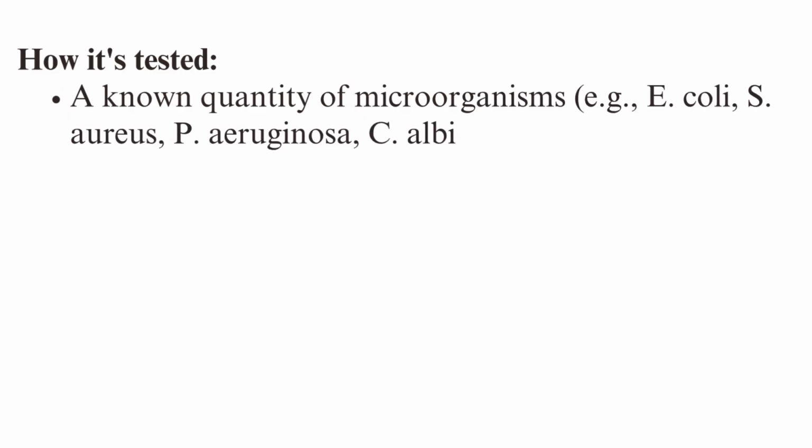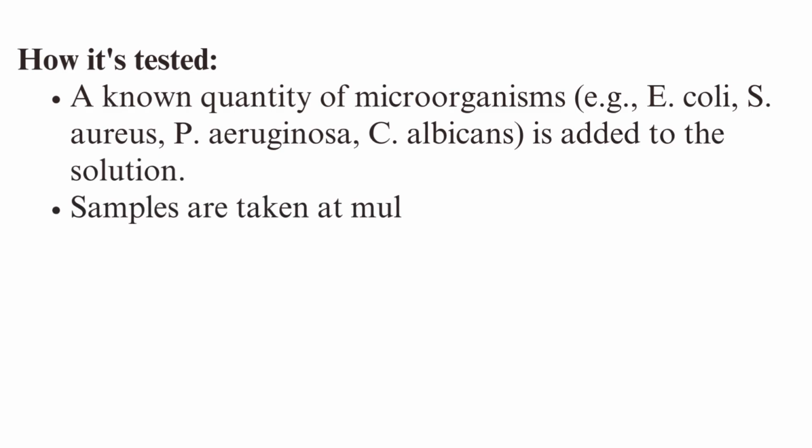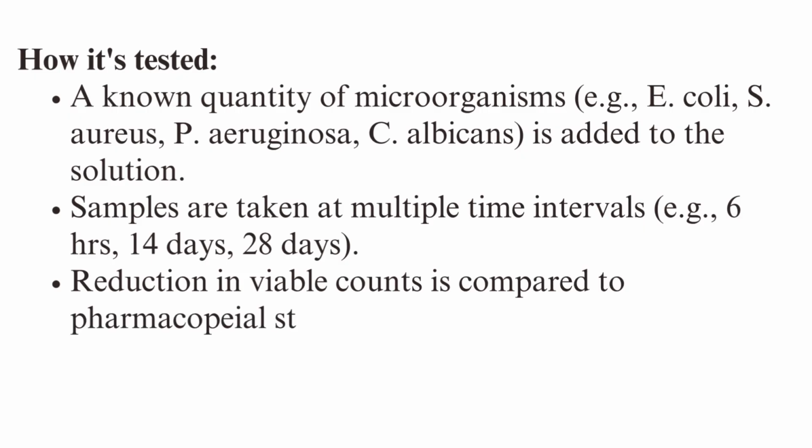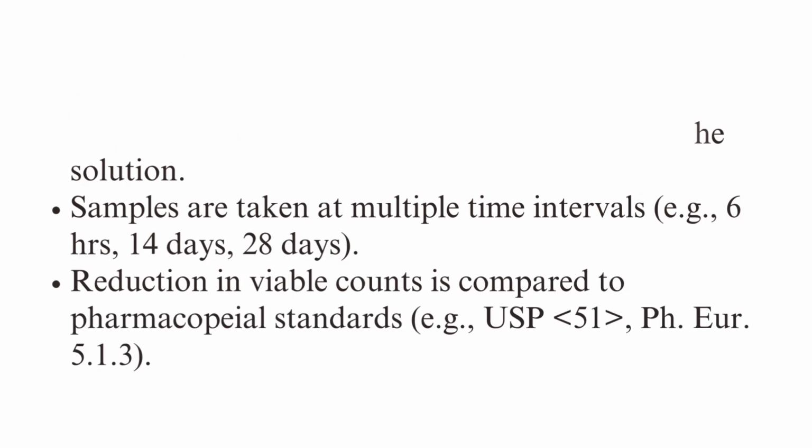How it's tested: a known quantity of microorganisms, example, E. coli, S. aureus, P. aeruginosa, C. albicans, is added to the solution. Samples are taken at multiple time intervals, example, 6 hours, 14 days, 28 days. Reduction in viable counts as compared to pharmacopoeial standards.